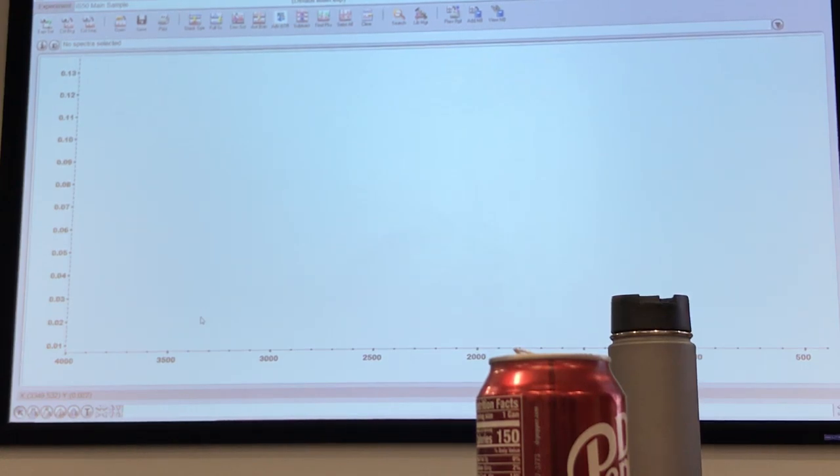You always will have to see what's left, because that's what we check also with the overlay: is there a tiny bit of peak that is left unaccounted for? There is a lot of story behind it, because some of the peaks are merged into other peaks. Unless you subtract that one material out, you may not really see it. When you say subtract, you actually mean subtraction: the intensities are being subtracted from the matched spectra to the ref. Yes, that's one way to do it.